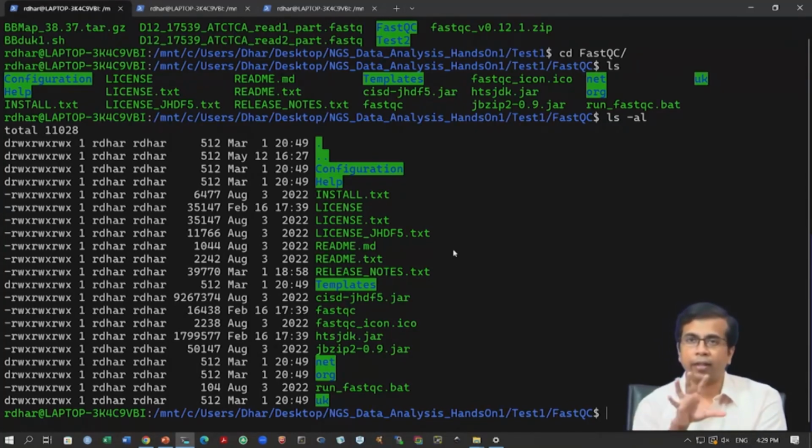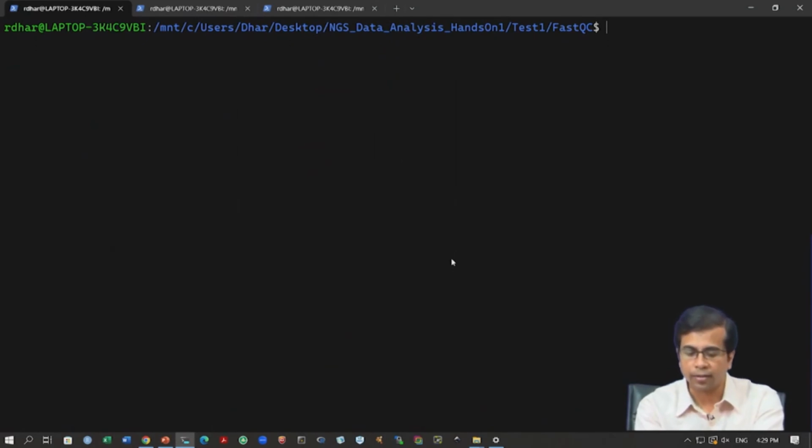If you are running through that program window, you would have to load individual files, right. You can do only one file at once, and you will have to do this repeatedly. If you have, let us say, 10 files, you have to do this 10 times. So, we will prefer using the command line route. Let us utilize this command line tool and then do the quality check.